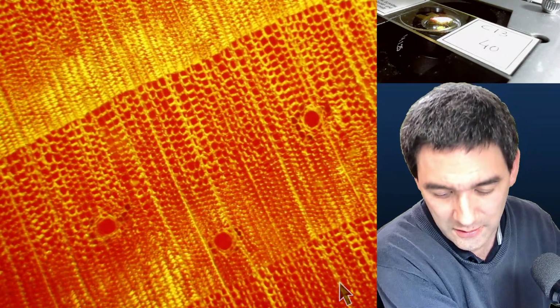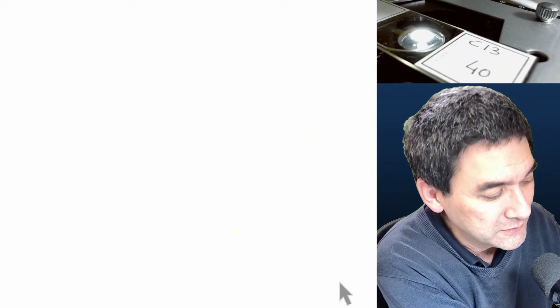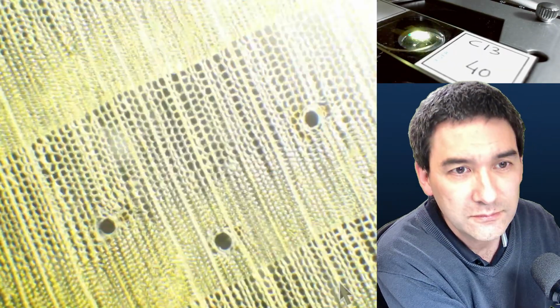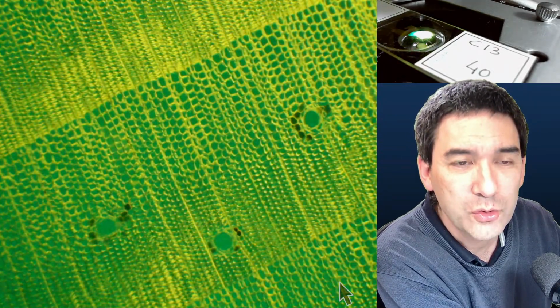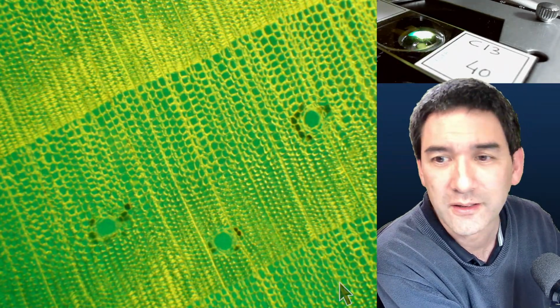Okay, and we also have green-yellow. Generally, for water samples, I like the backgrounds to be blue because this gives a little bit the illusion of water. That's not green-yellow. Again, I have to adjust it. You get the idea.